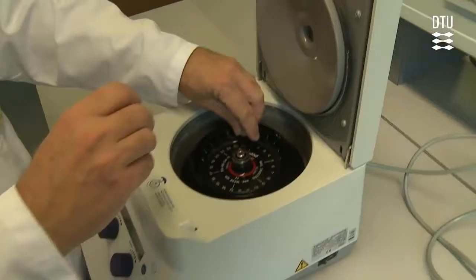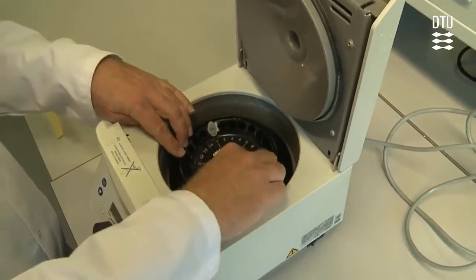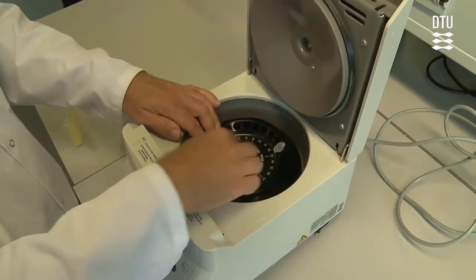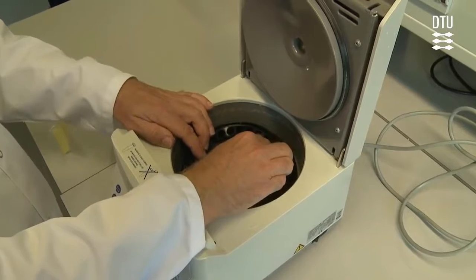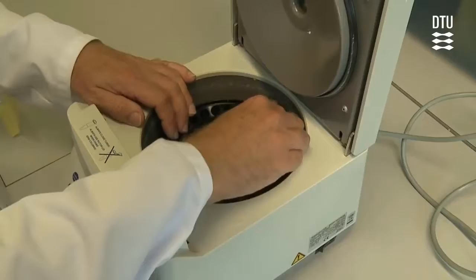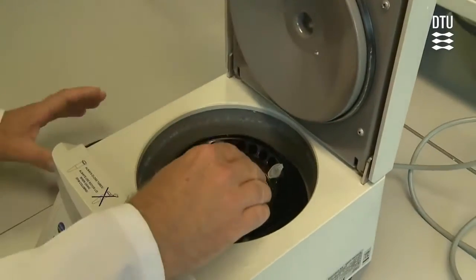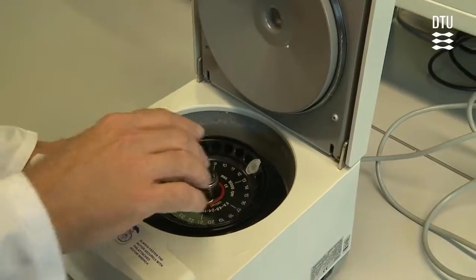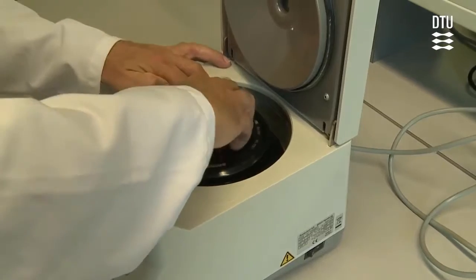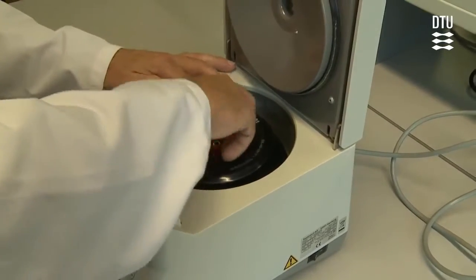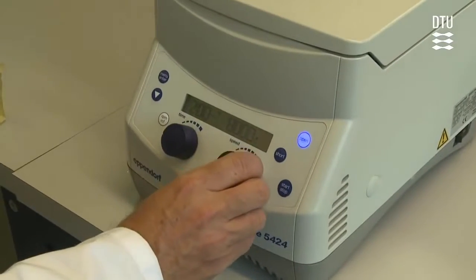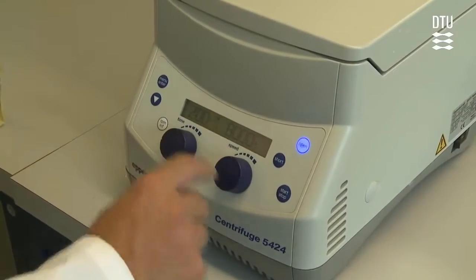Now it goes into the centrifuge. It's important that it's balanced, so you place them opposite each other. A good trick is to orient the hinge so it will be pointing upwards or outwards of the centrifuge, because the pellet that may be formed can be very hard to see, and when you do that, you know where to look. You put on the lid and close the centrifuge. In this case, you run it for 2 minutes at 8000 RPM.